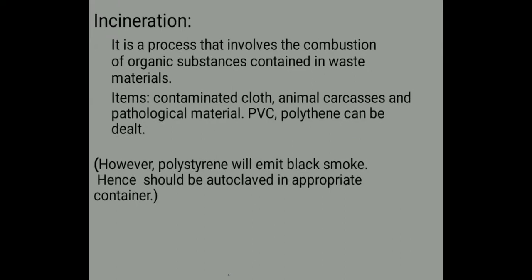Next we have incineration. It is a process that involves the combustion of organic substances contained in waste material. Items include contaminated clothes, pathogens, pathological materials, PVC, polyethylene, etc. However, polystyrene will emit black smoke, hence it should be autoclaved in an appropriate container.